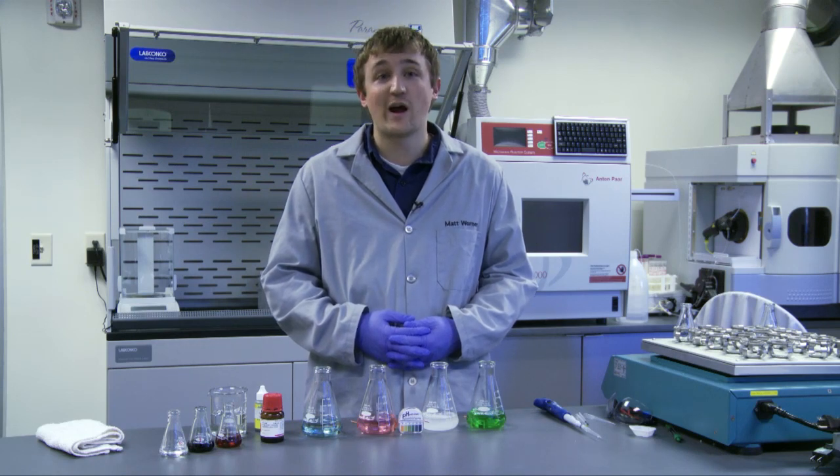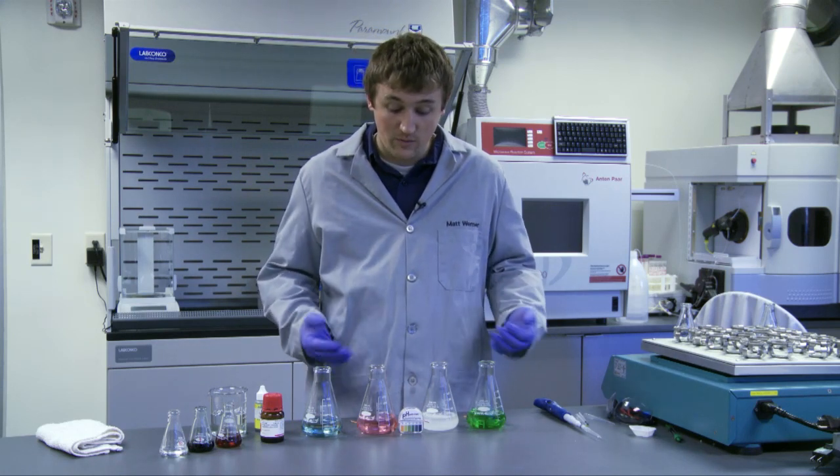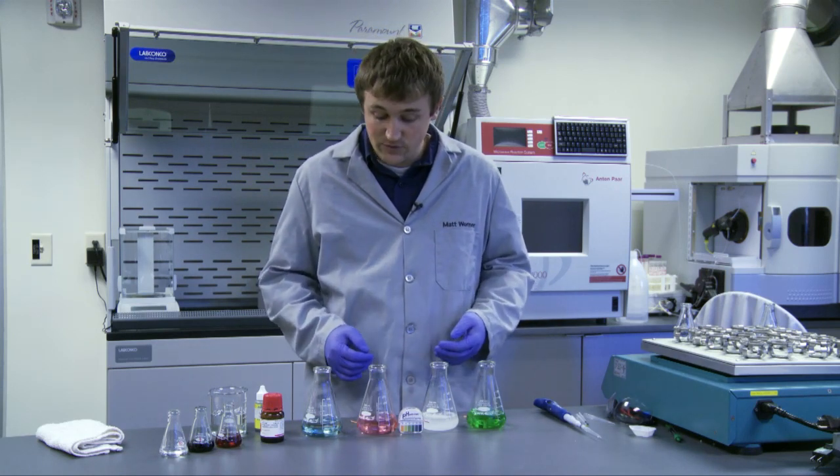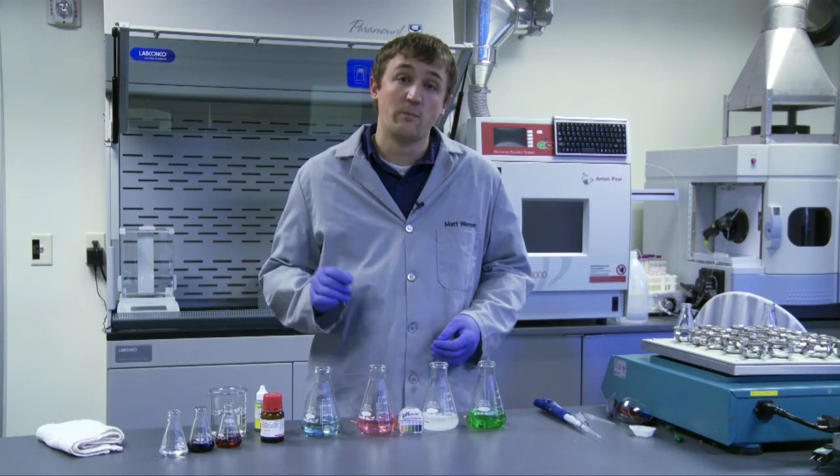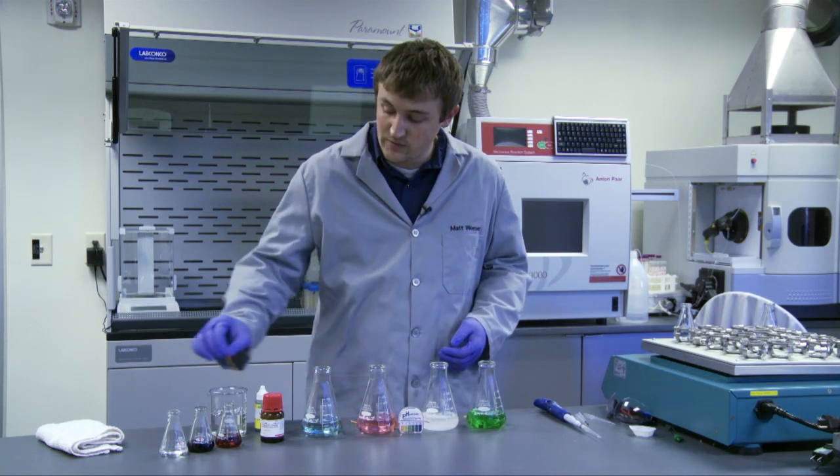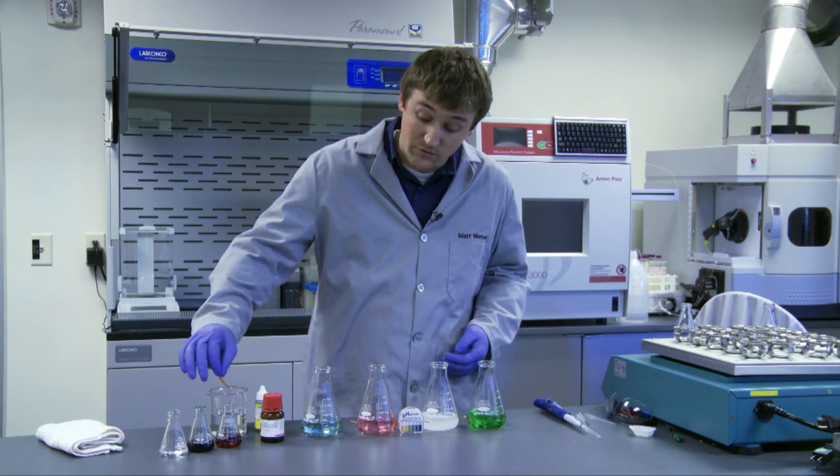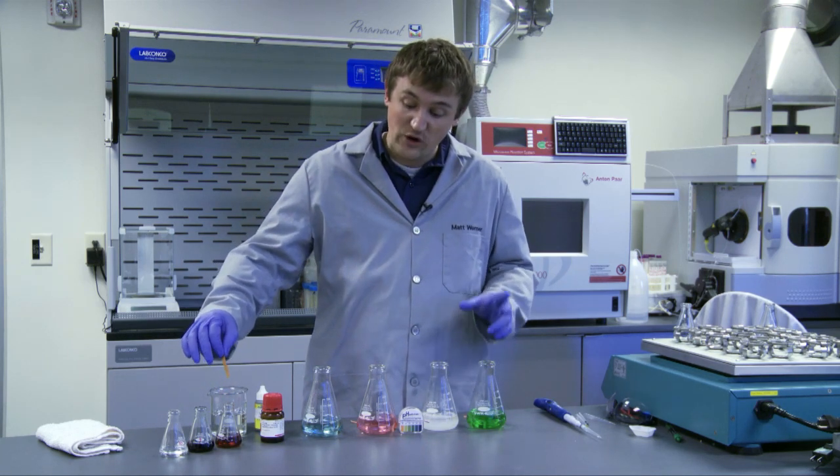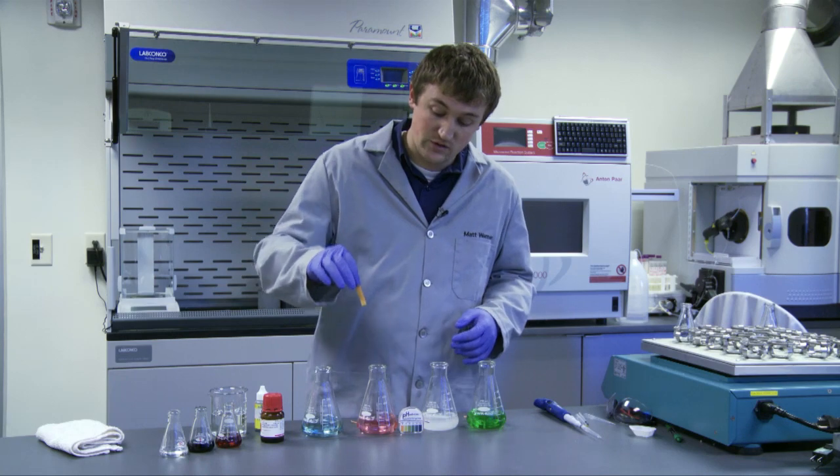All right. We're back. It's been four hours now and we're going to go ahead and do our ammonia volatilization measurements. We're going to do this with an ammonia strip and what we'll do is dip this in water and then place it in each of the flasks and it's going to tell us how much free ammonia is above each of the solutions.